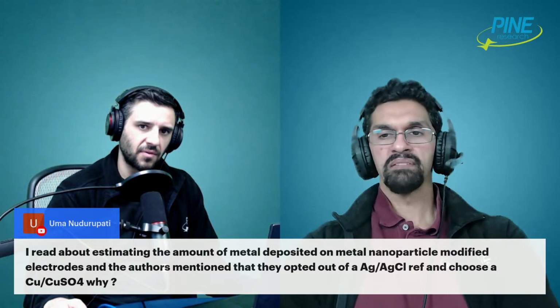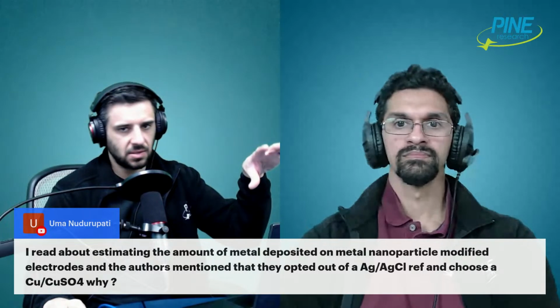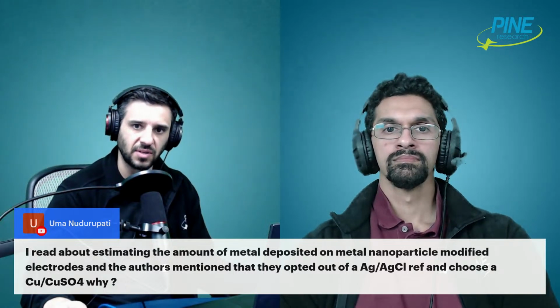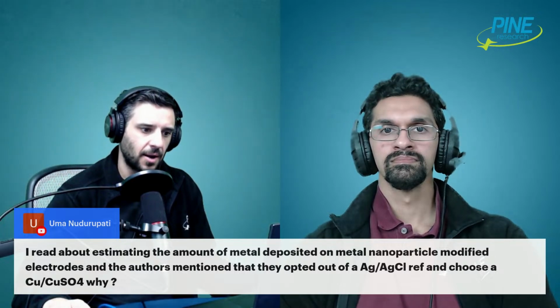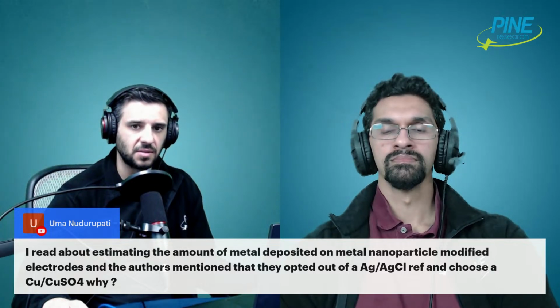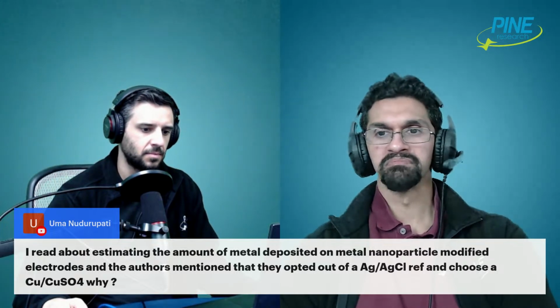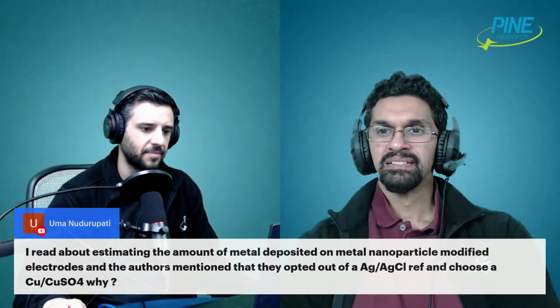If you have a silver chloride reference electrode, even if you don't have chloride in the main solution, you'll get a little bit of diffusion of chloride through the reference electrode frit, and you might get a few ions of chloride in your main solution over time. If you're trying to make really sensitive measurements and you can't deal with an anion that might adsorb to the surface, you probably do away with the chloride. But that's just my guess.